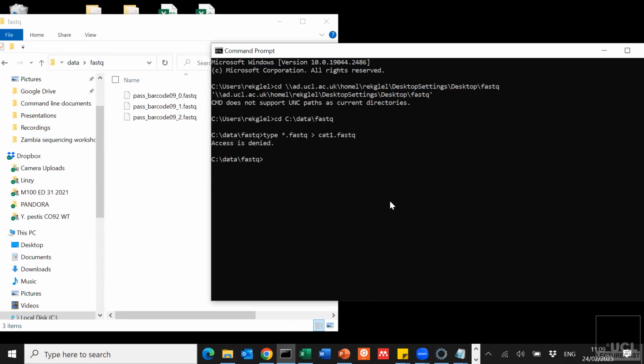It's done it for you. Okay, well, at least somebody's managed. Yeah, I don't know why my access is denied. Why does this keep happening? I don't know.